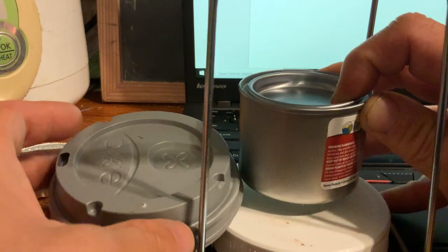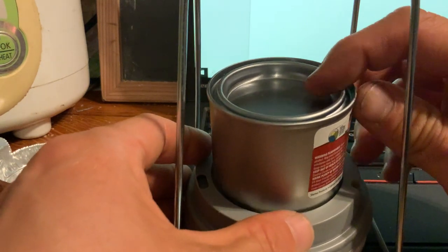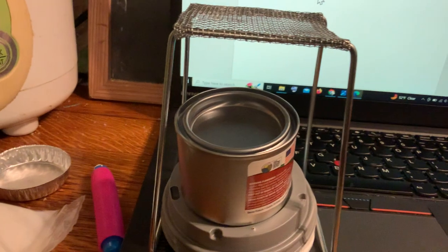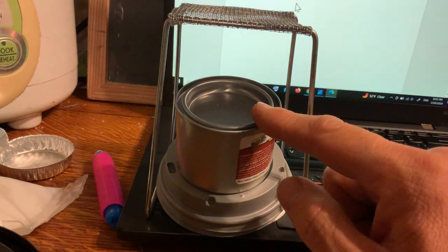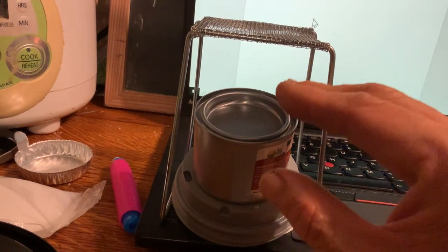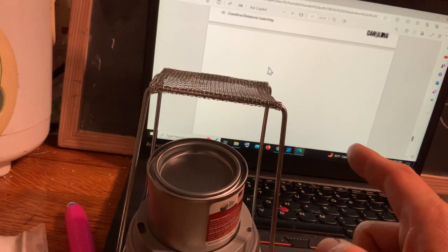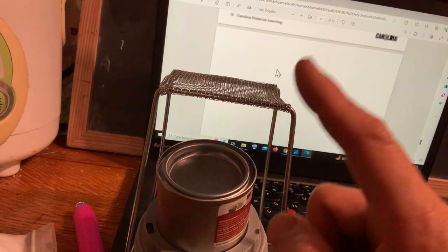You can prop up your Sterno can with whatever you find in your kitchen, but make sure it is quite stable, not wobbly, and not likely to fall over. Prepare the platform in advance so that when you turn on the Sterno can, you can easily position it so the top of the flame touches the bottom of the wire mesh. Do not turn on your Sterno can until your pan is ready to be heated — there is limited fuel, and in this experiment we will be using all of it.